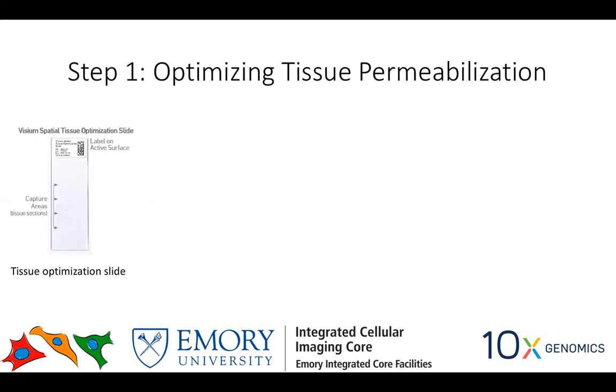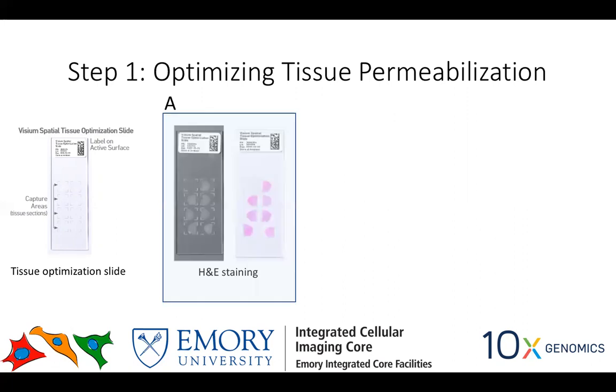Okay. So in the first, the tissue optimization slide, there will be some imaging done on that as well, right? Yeah, so that's what I'm going to. On that slide, we'll be doing epifluorescence imaging at, let's say, 568 nanometer wavelength. Okay. So pretty much like a Texas Red or TRITC kind of imaging over there.